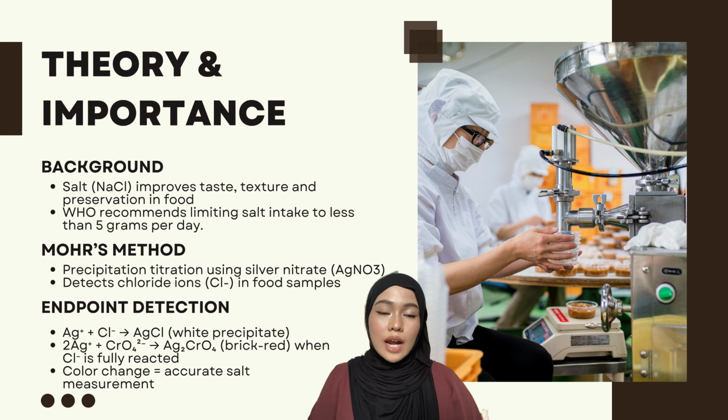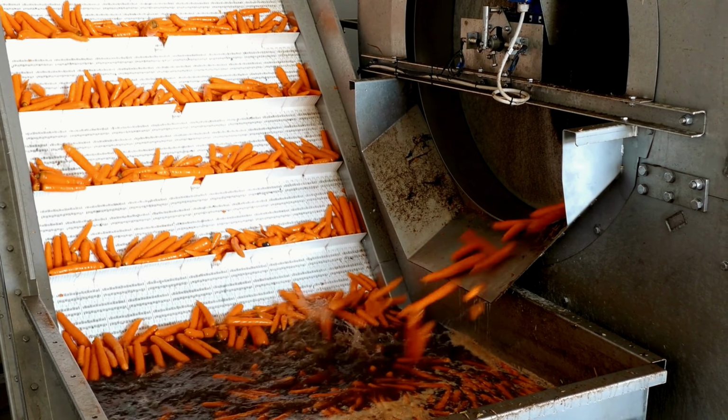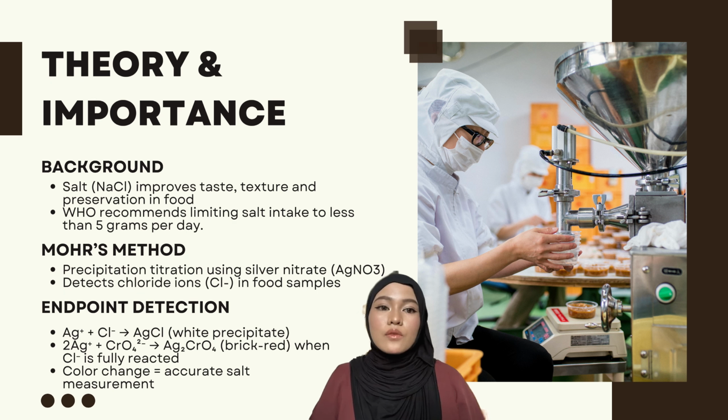Salt, or sodium chloride, is commonly used in processed foods to enhance taste, texture, and preservation. However, excessive salt intake can be very harmful. The World Health Organization (WHO) recommends consuming less than 5 grams of salt per day to reduce the risk of chronic disease. Salt content in food can be measured using Mohr's method, which is a type of precipitation titration.